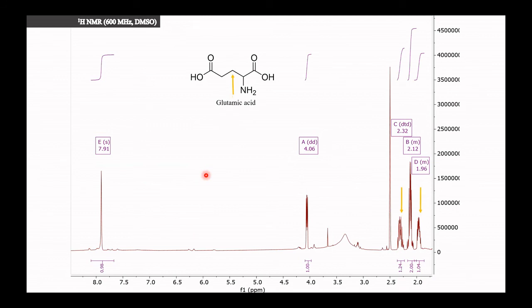Here are the two protons. Now, I will give you new information. If the protons are not chemically and magnetically equivalent, it means they are different in the stereochemistry. It will give not only one value of the chemical shift, not only one delta, but two values. Why? Because they are two protons which are different in chemical shift. That's why you see the chemical shift of the first one and second one, axial and equatorial proton.